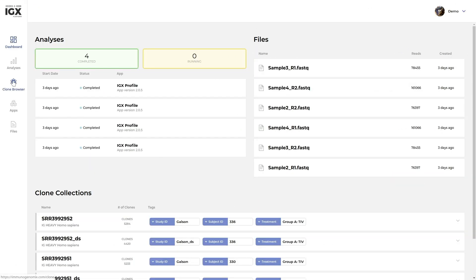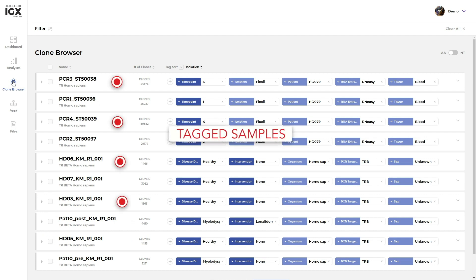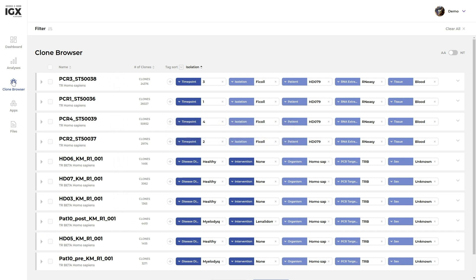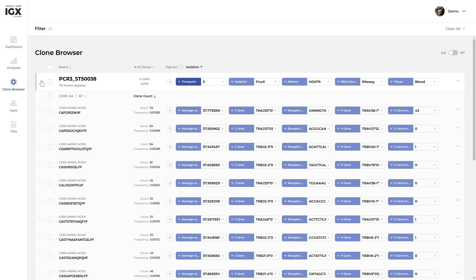The clone browser is the core of the IGX platform. Each entry represents a sample along with its associated annotation tags. To view all clones or clonotypes in a sample, click on the triangular widget on the left to expand the sample.